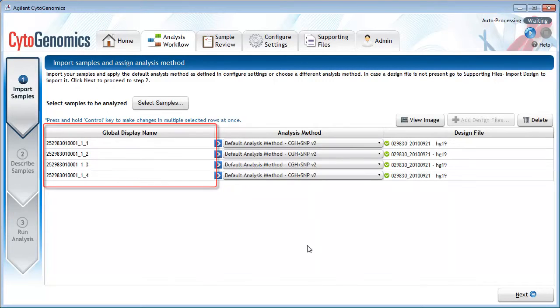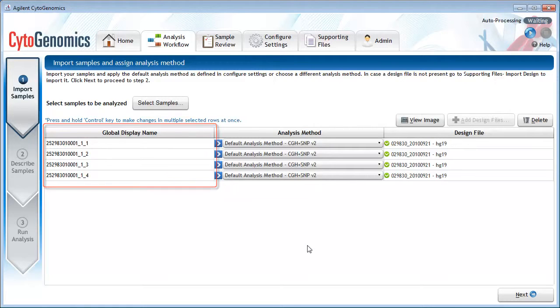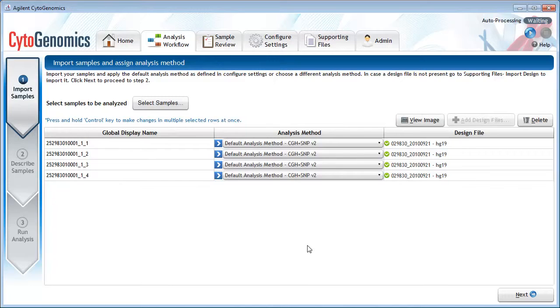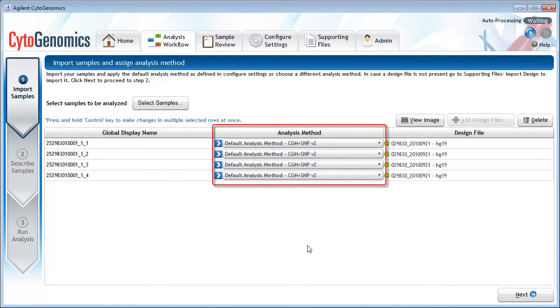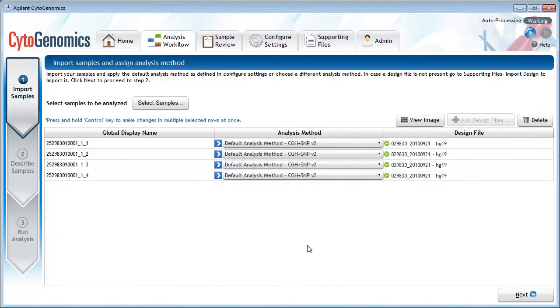The leftmost column is the global display name. This name is the identifier that will be used throughout the software. You can change it here or use the default. The Analysis Method column displays the analysis method that the program will use to analyze the sample. The default analysis method selected here is based on your mapping configurations.